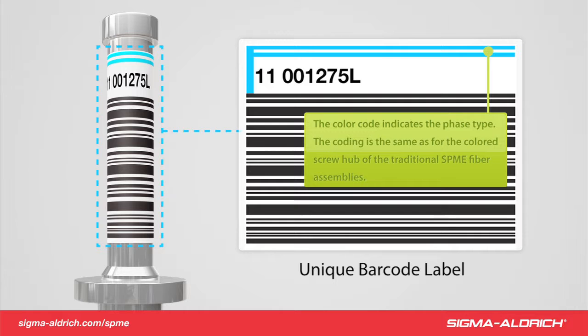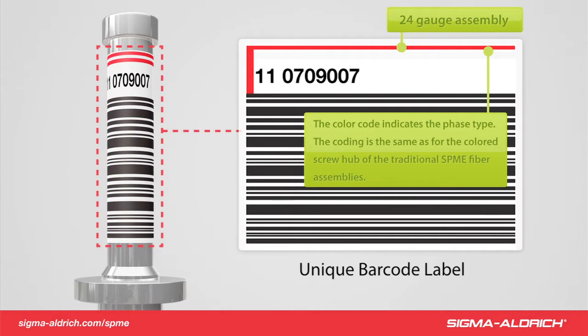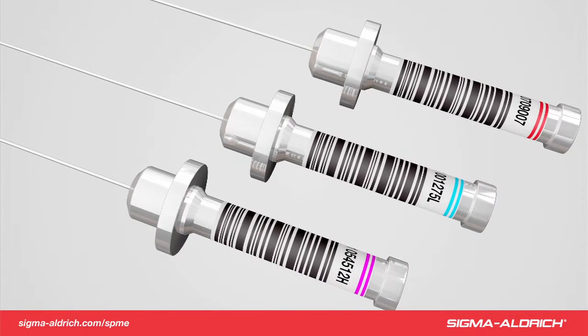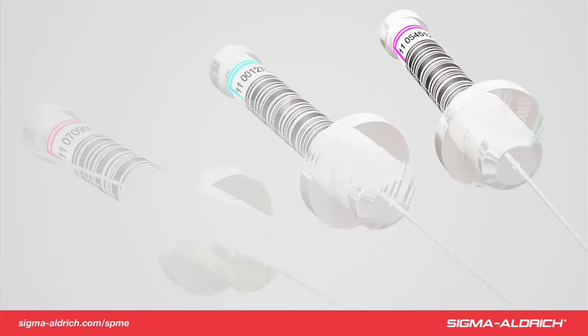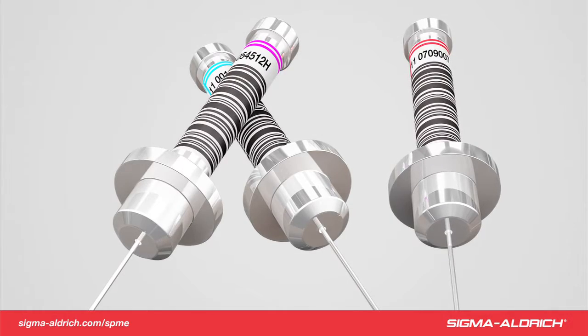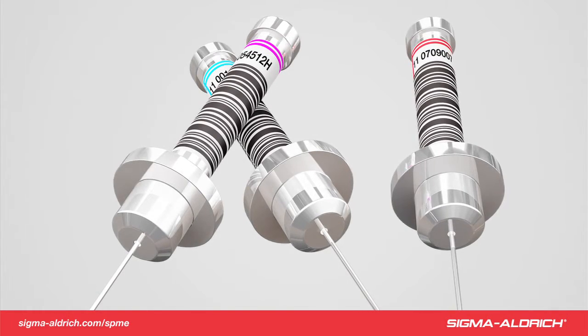The color-coded stripe also identifies the phase and gauge size. The color-coded top is the same as the common SPME assemblies. For example, the red fiber is a 100-micron PDMS fiber assembly. One stripe on the label identifies a 24-gauge assembly, while two stripes identify a 23-gauge version. The SPME Fast Fit Assemblies are available in all common SPME fiber phase coatings, so current applications can be directly transferred to existing methodologies. The color coating is associated with the different fiber phase chemistries.